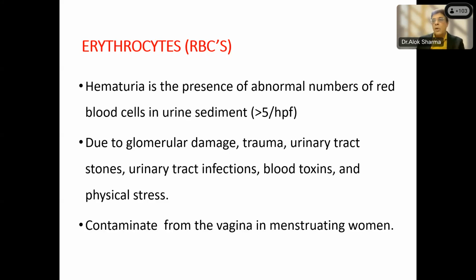Needless to mention, you should always exclude any contamination from the vagina in women. So before commenting on the significance of RBCs, it's very important to exclude this. It is a very important thing which is often overlooked by a lot of labs, and you end up giving reports which are unnecessarily alarming and lead to a lot of investigations which are not required.